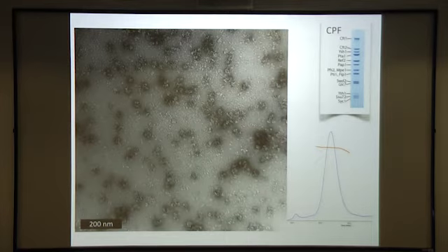It happens because specimens are exposed to surfaces and conditions that are really different from inside the cell. There are 5 orders of magnitude more surface area to volume ratio in the thin films of buffer that we use in preparing cryo-EM grids than in a 1 microliter drop of water. But also many aspects of the specimen preparation are still poorly understood and difficult to master.